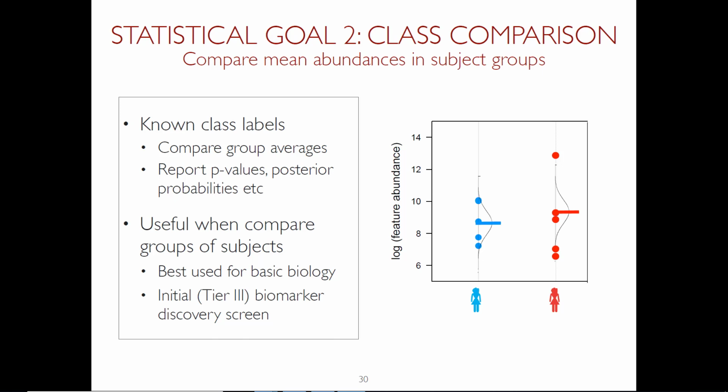What we would like to do is to see, for this particular protein, so this will be the log abundances, maybe for a peptide of the protein or the summarized values of the protein, whether this protein is changing in abundance between healthy and disease systematically, or is this change consistent with the random variation between the groups.